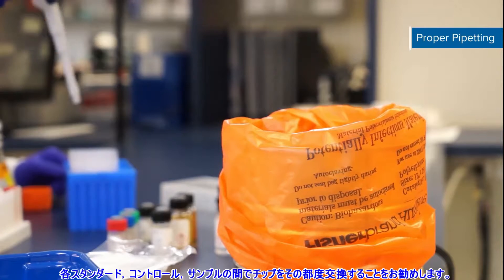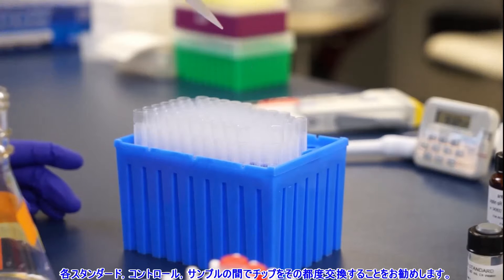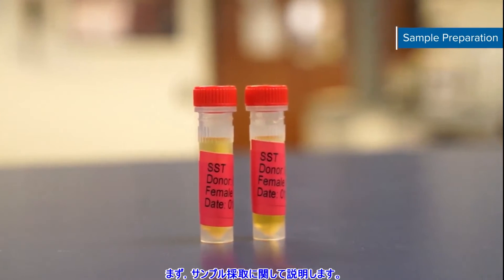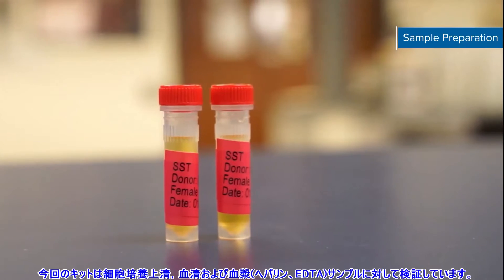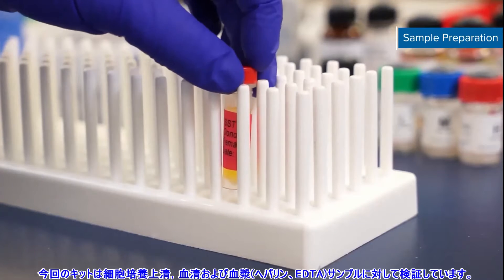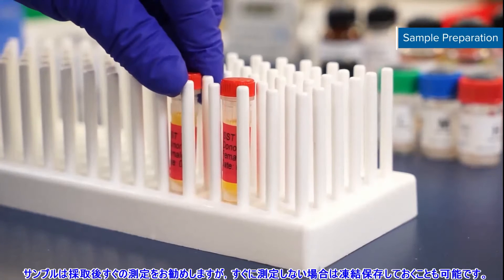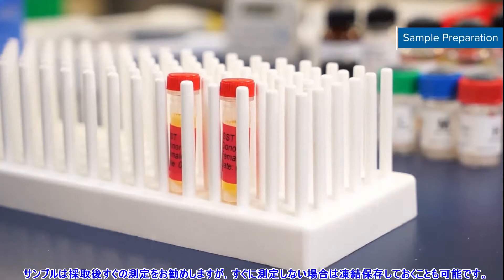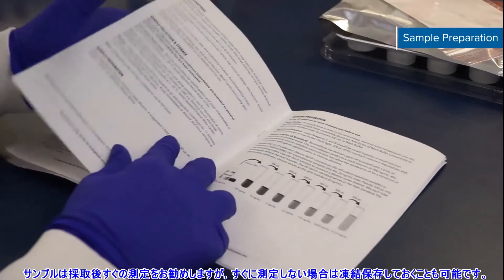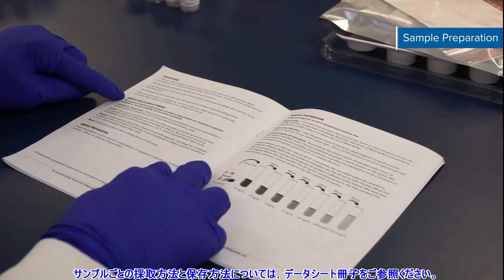We recommend changing your pipette tips between standard concentrations, control levels, and each sample. The first step in the process is to collect samples. This kit is validated for cell culture supernate, serum, and plasma samples. Citrate plasma has not been validated for use in this assay. We recommend that all samples are assayed immediately after they are collected, but samples can be frozen for future use. Refer to your kit booklet for sample-specific collection and storage instructions.